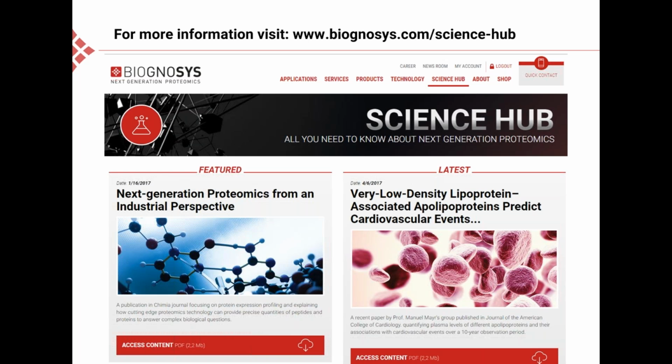The next question is, what is the best way to export results from SpectroNaut to create spectral libraries for SpectroDive? Currently, this link is missing, but it's something we're looking into, so it'll be coming with a future update, perhaps.